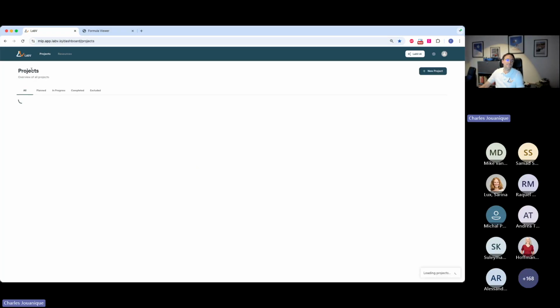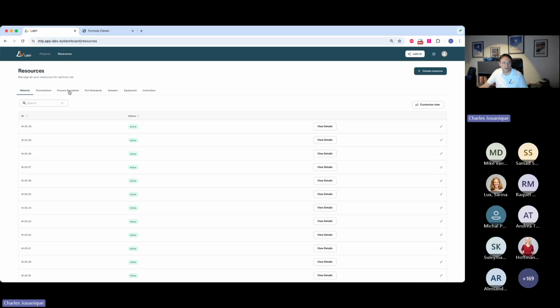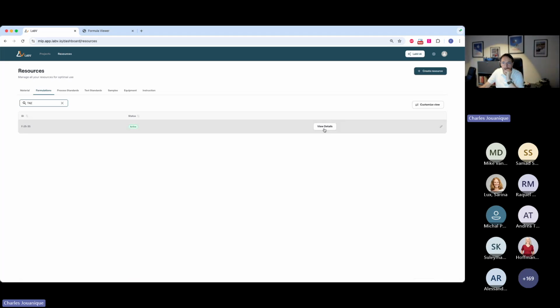All right, now, typically, if I had my experience, like my expertise, I know all the products we have, I would go through and start developing my formulations, right? Or optimizing. Now, I'm relatively pretty new in the team, so I don't know all the products yet. I'm going to go back to my resource library and then basically in the formulation library search for these T42, it was called, and look at the details.